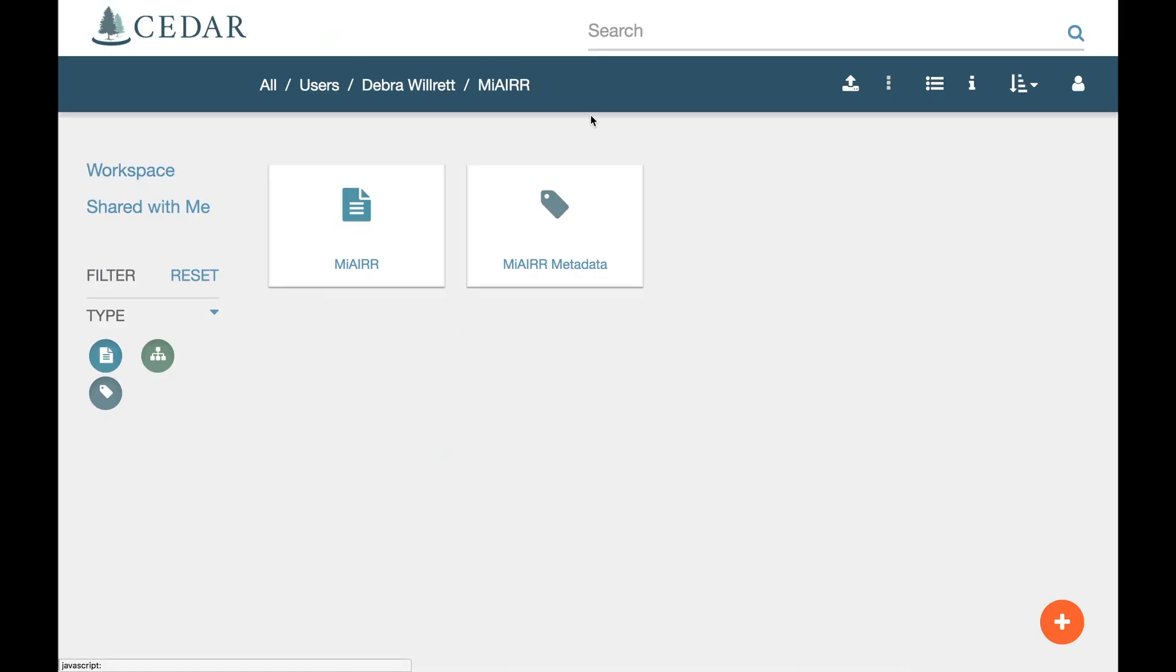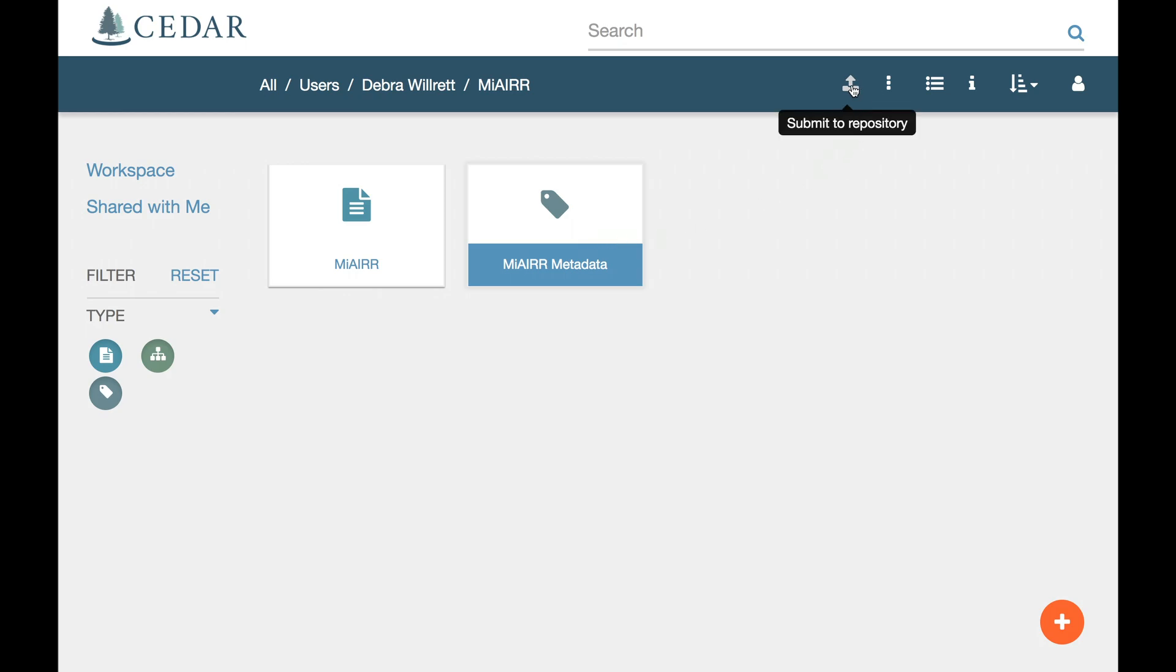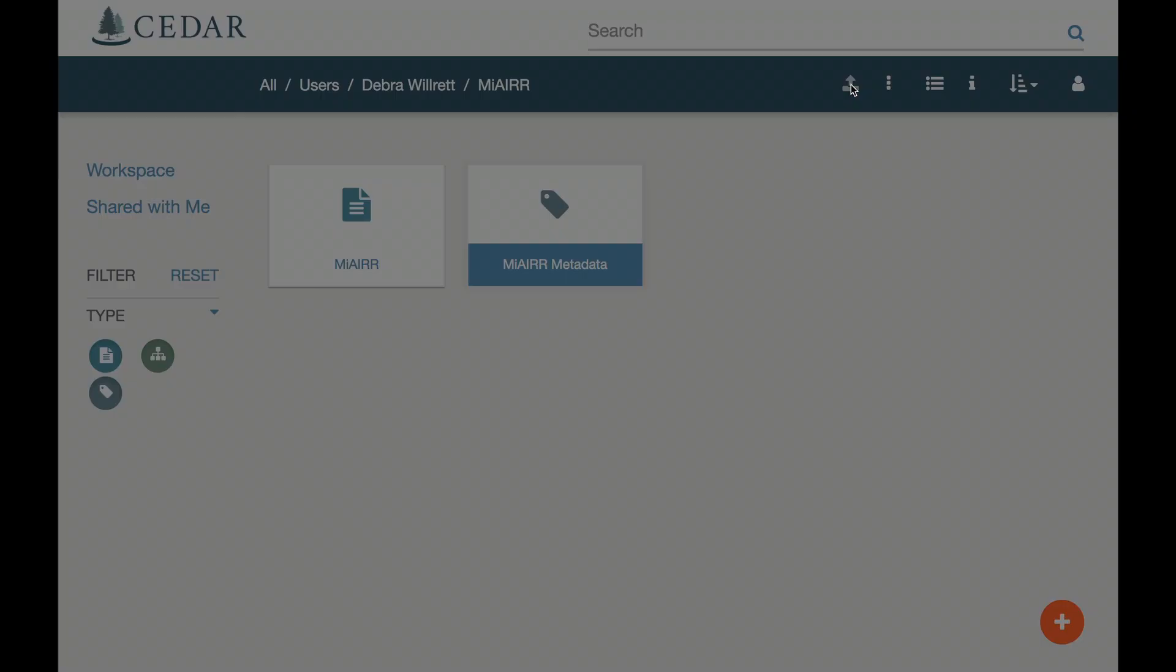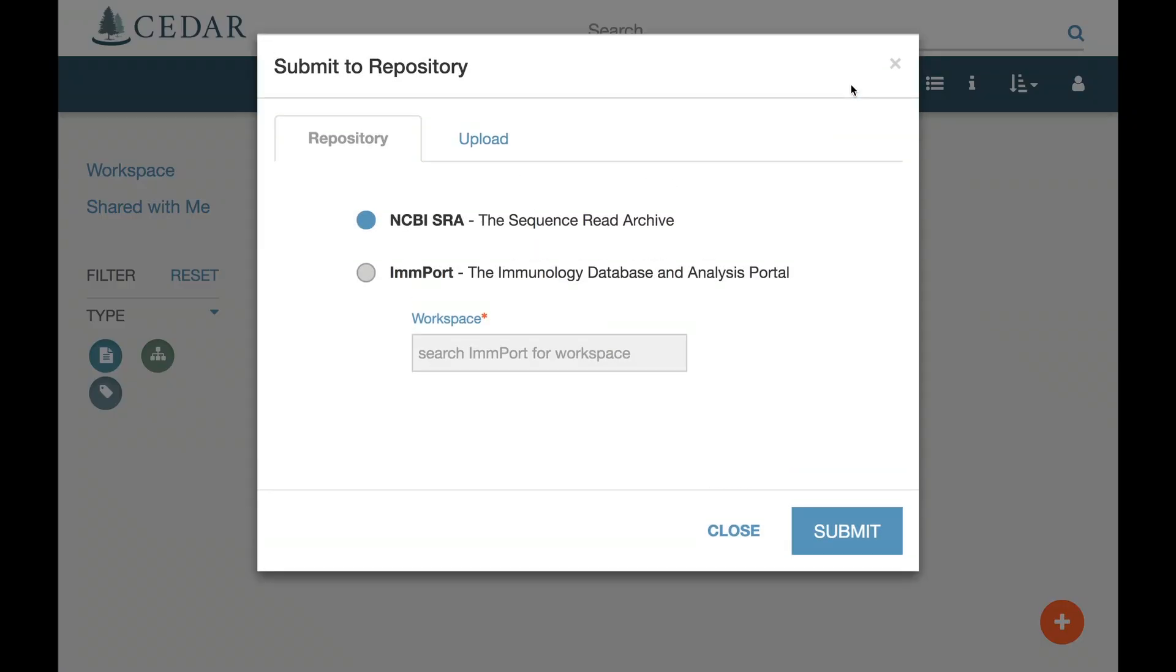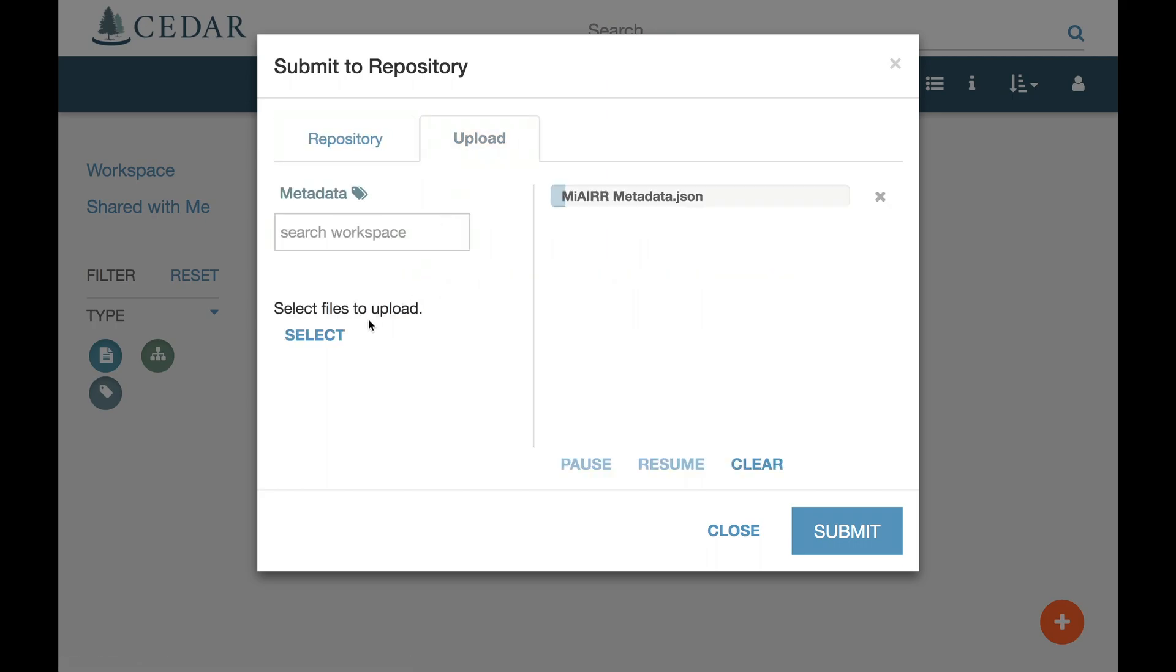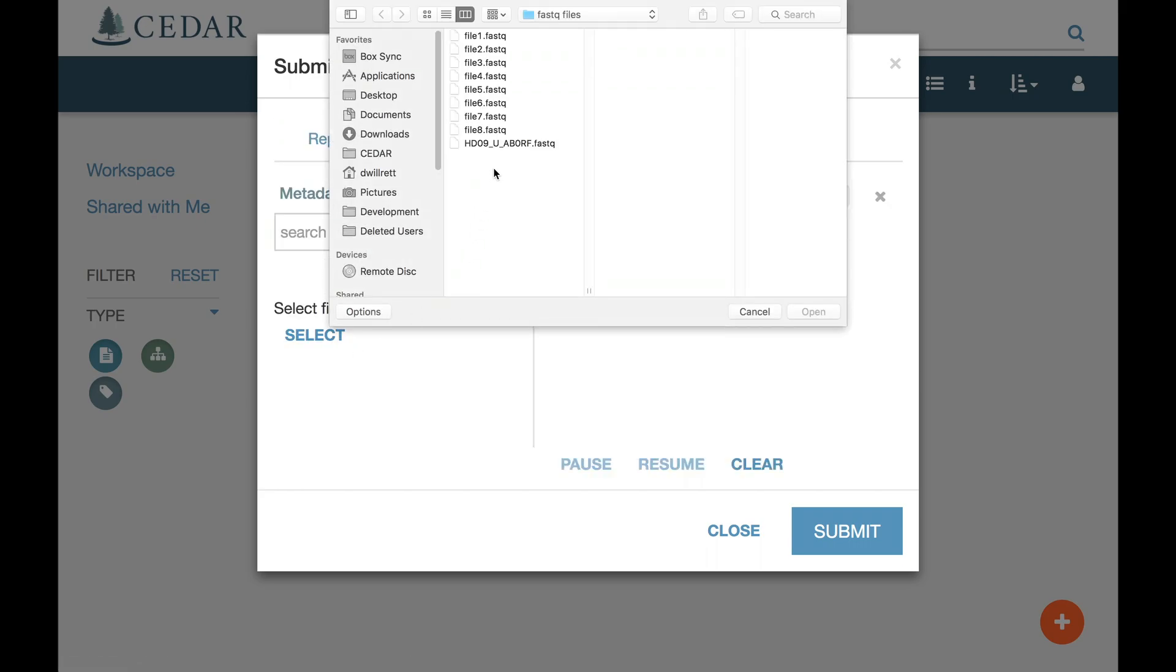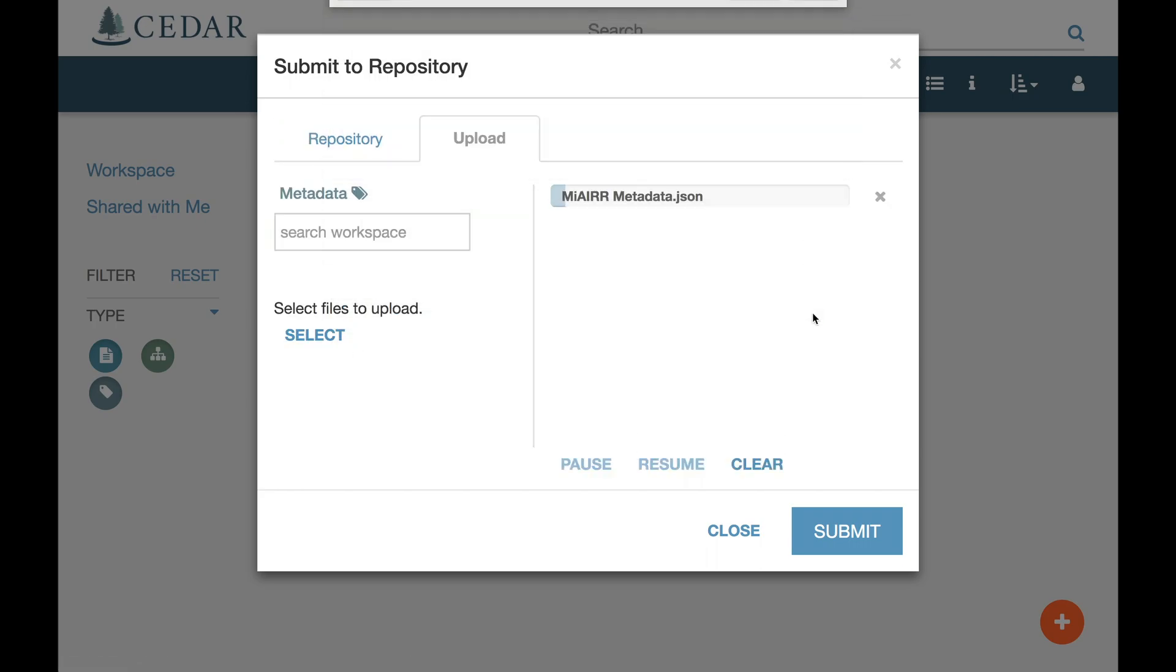Now let's do a submission. Select the metadata and click Submit to Repository in the toolbar. Make sure the NCBI SRA Repository is your target. Select the raw data files that you will need. When you're ready to submit these files, click Submit.